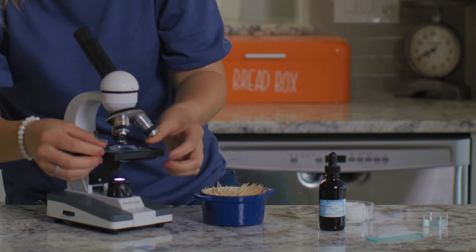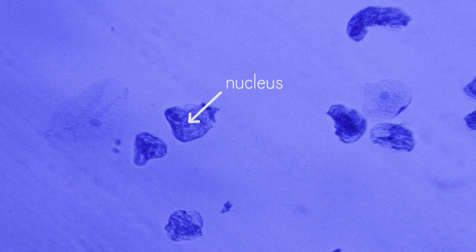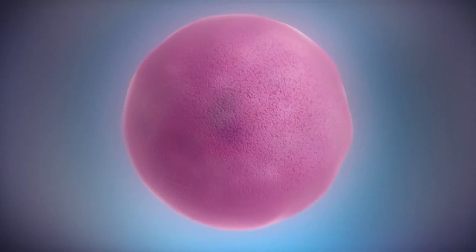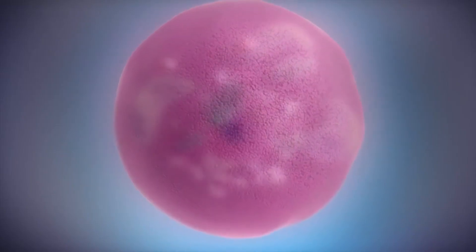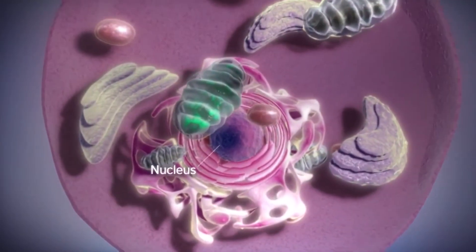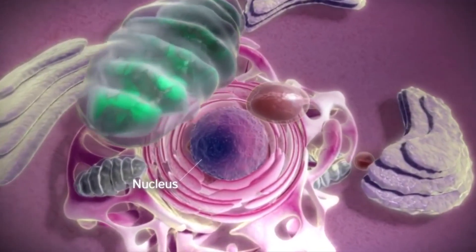Let's find out! What do you see on this slide? Can you see the dark blue nuclei in this sample, just like the last one? And here is the outer circle that makes up the cell membrane. All skin cells, no matter what part of the body they come from, have a nucleus, cytoplasm, and a cell membrane.